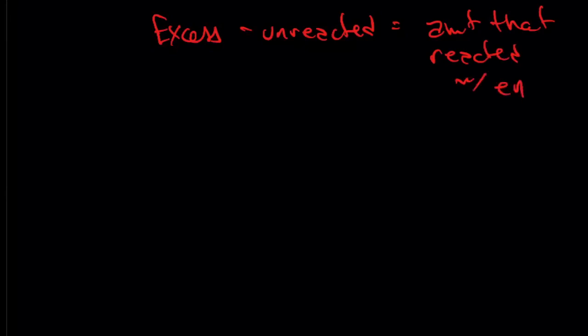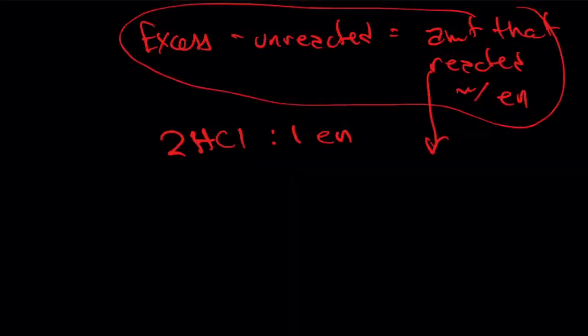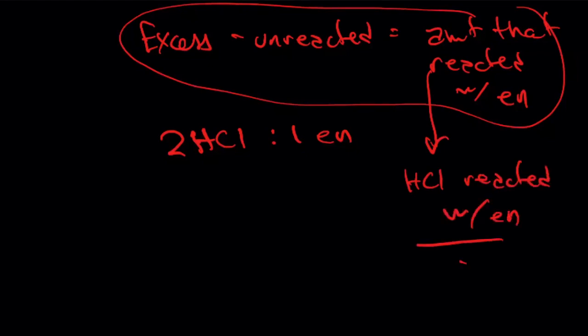And since it takes 2 hydrochloric acid for every 1 ethylene diamine, if you take this amount and divide it by 2, that's the amount of ethylene diamine in your compound.